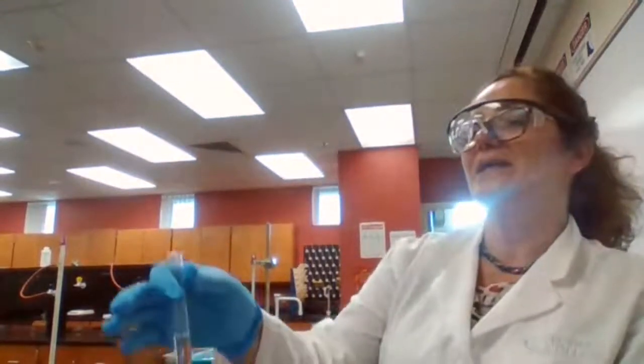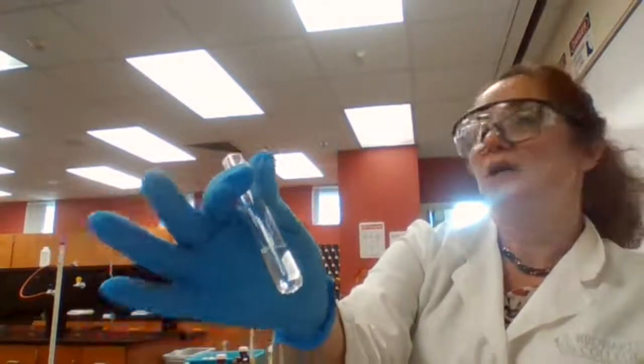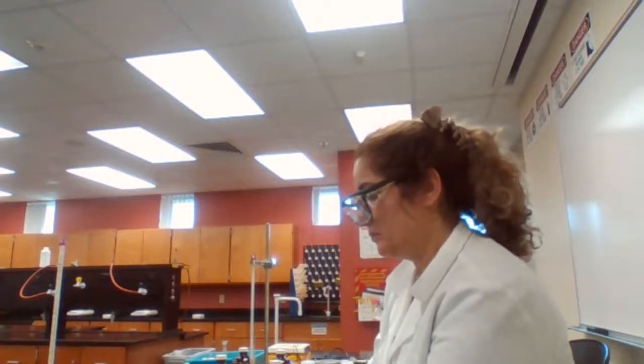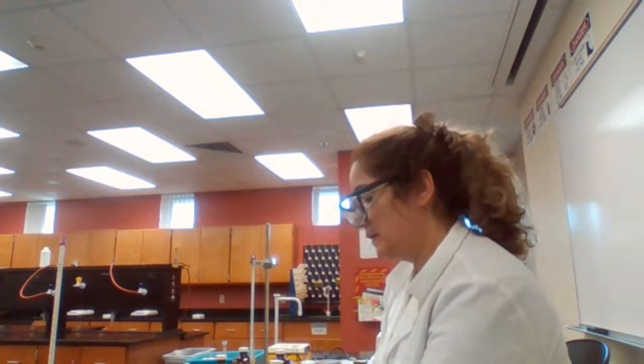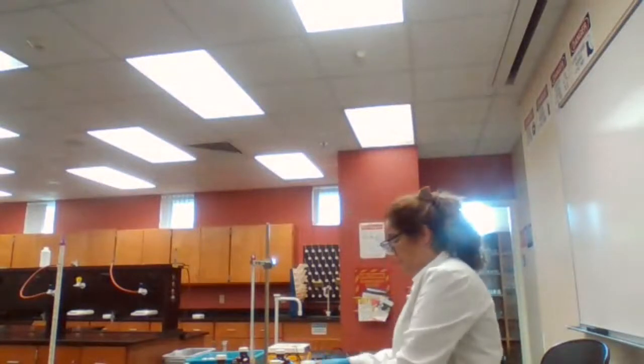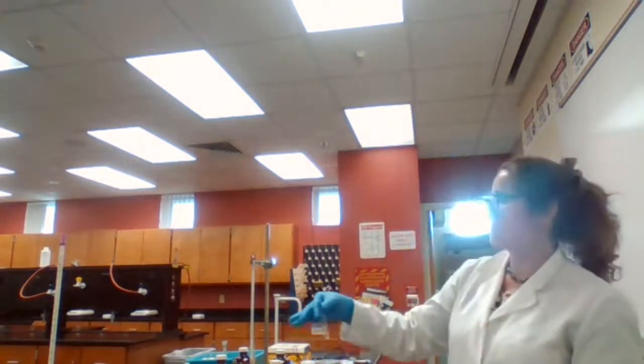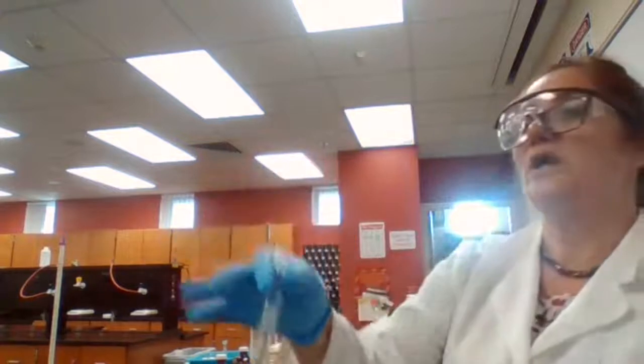Okay, this one was naphthalene in methylene chloride, right? What do you think? Soluble, yes. And next one would be naphthalene in pentane. I add a few crystals of naphthalene, the solid, and liquid pentane. It also dissolved completely, so soluble.